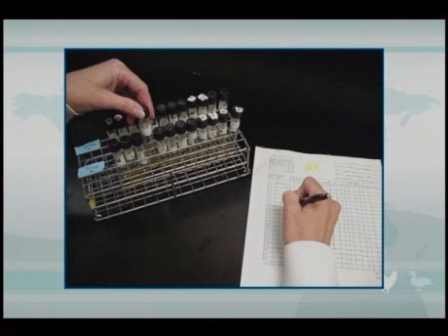And of course, within the laboratory, you need to develop a specimen handling system whereby each specimen can be followed through the laboratory with absolute identification. And of course, your samples must agree with the paperwork so that you can report individual results for individual samples to the submitter.